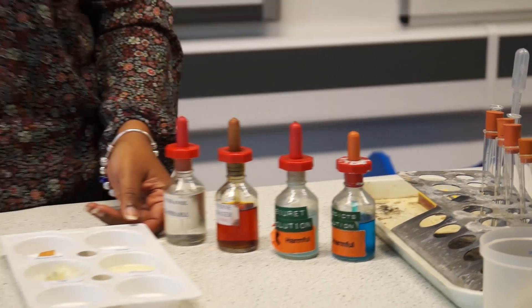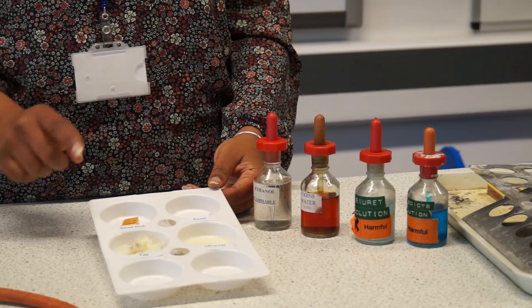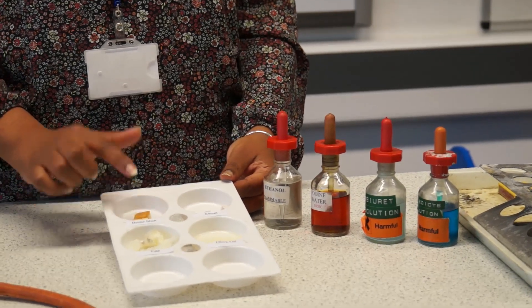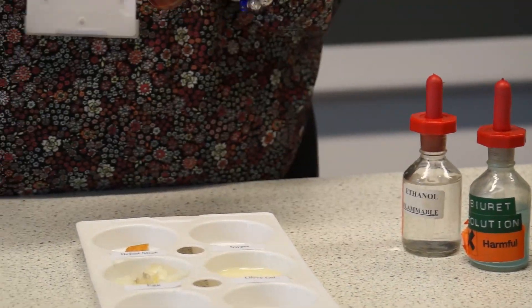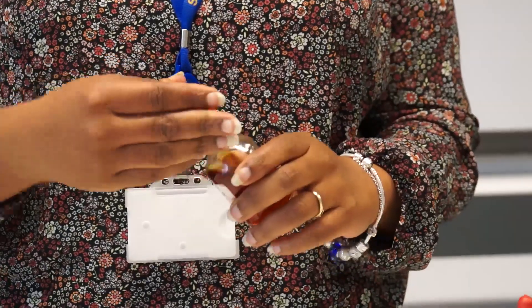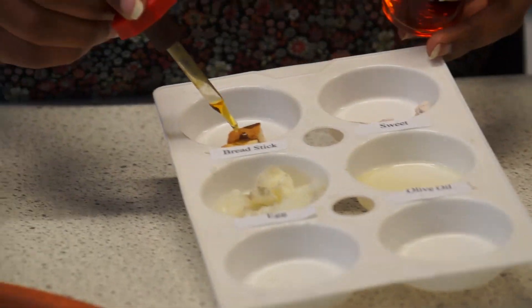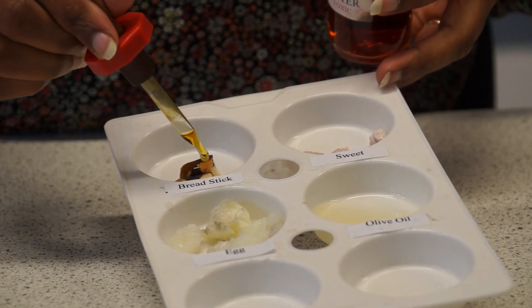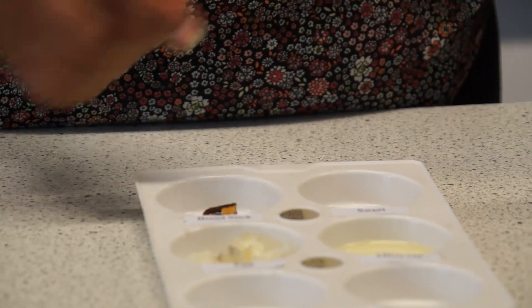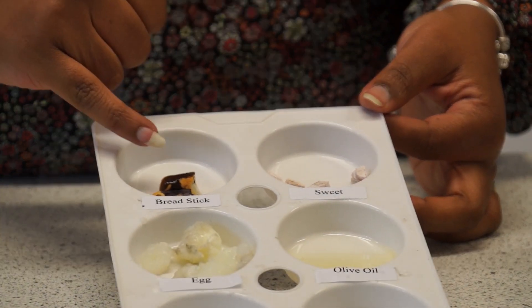So the first food test we're going to do is testing for starch. We test for starch in bread and we use iodine. If starch is present when it's added to the food, it should turn black. And you can see there that the breadstick has turned black, and that's a positive result for starch.